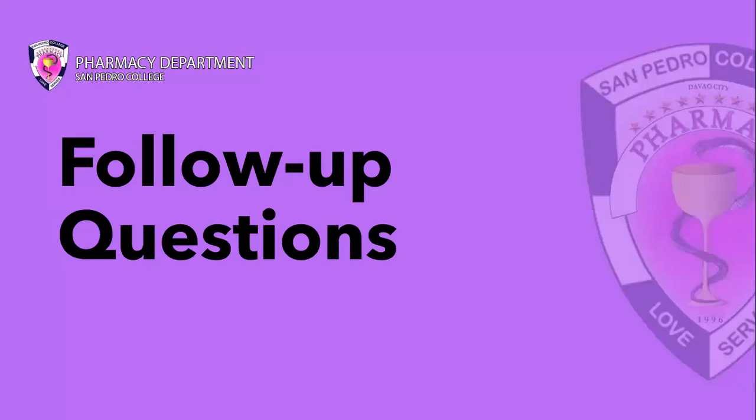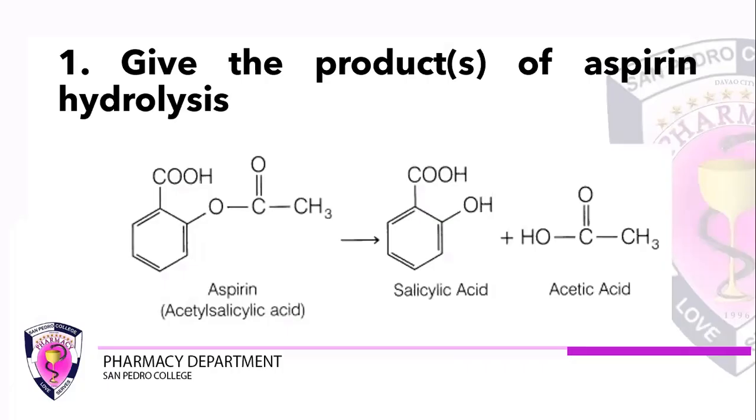Okay, and the last part for this post-lab, we have the follow-up questions. Now, for follow-up, we have the first question. Give the products of aspirin hydrolysis. By the way, in your experiment worksheet ata, ang first tanong is what is the chemical reaction involved? So, ang main thing ko doon, yung chemical reaction kanina.